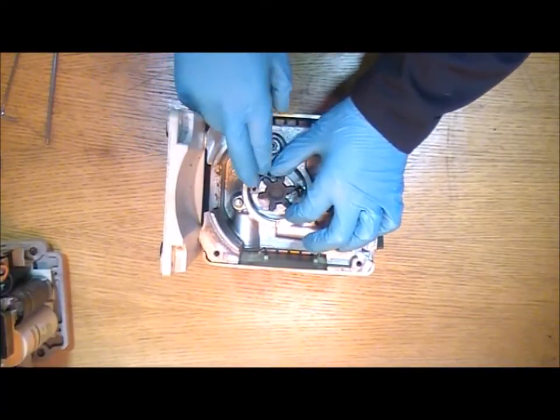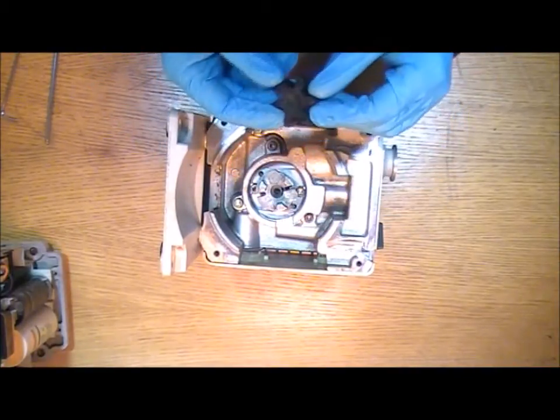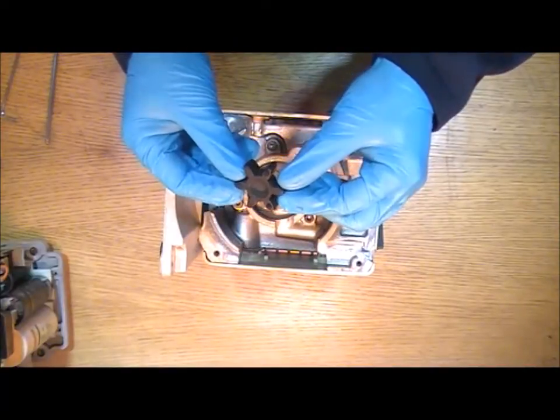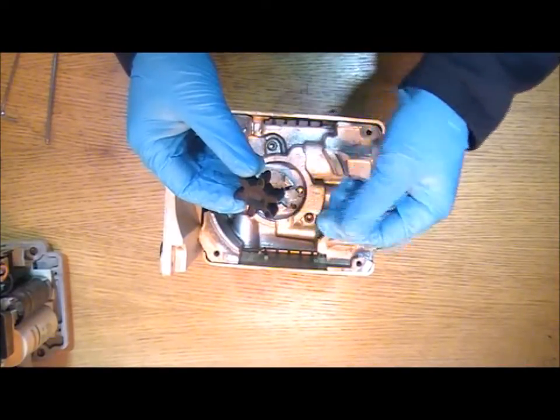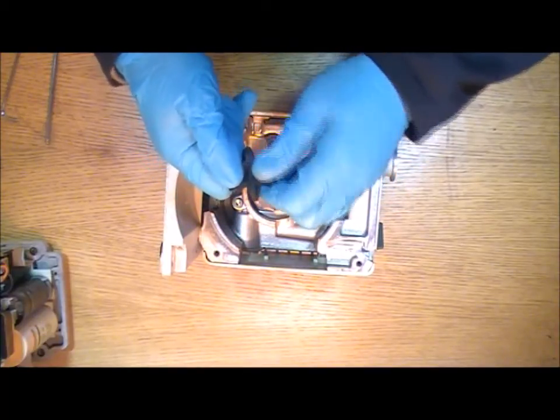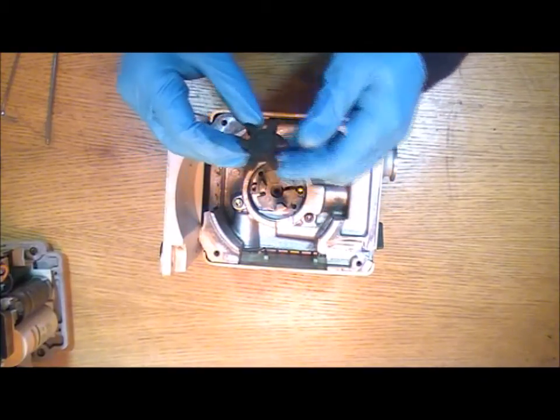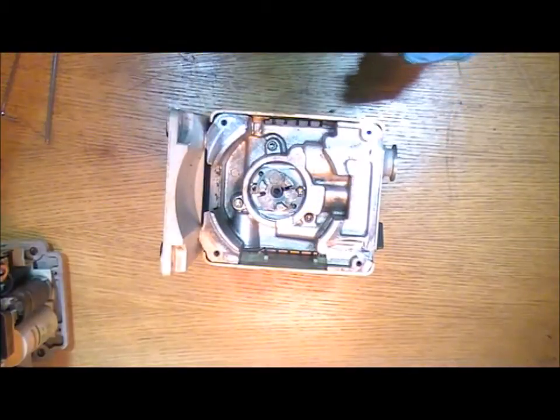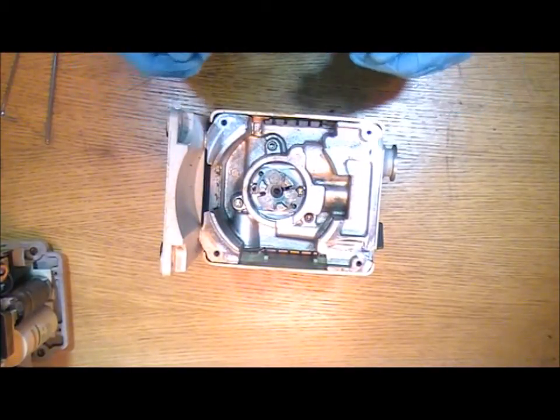And then in the centre here is the coupling. This is a rubber part that connects between the motor and the pump and it's elastic. So you want to make sure that that's still soft otherwise it will crack up. If it is hardened off then you need to replace that.